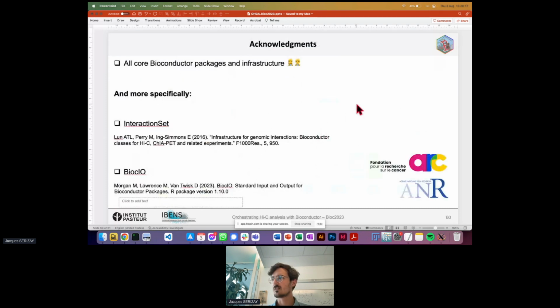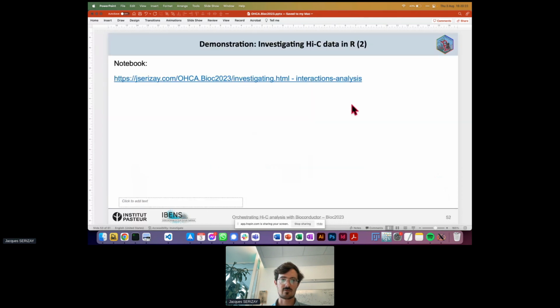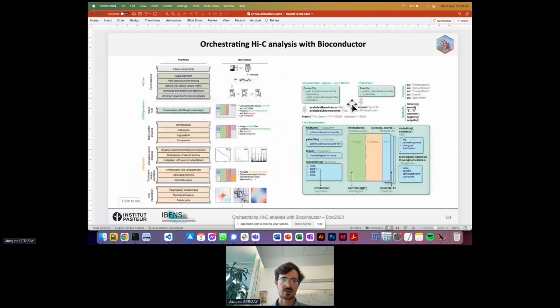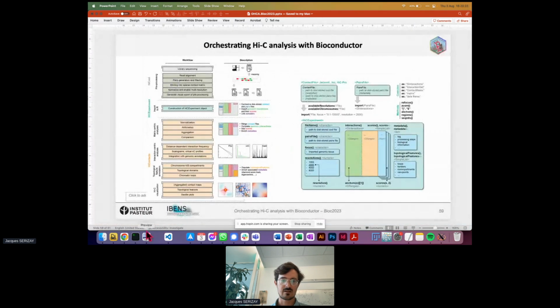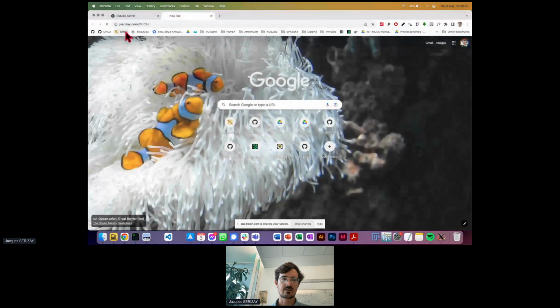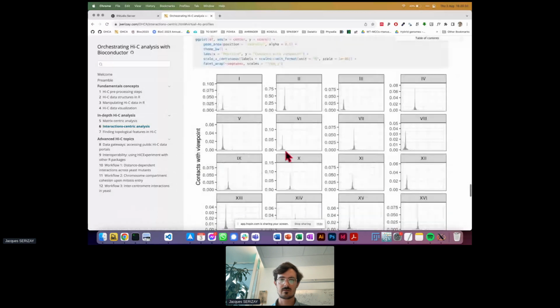Could you show a screenshot of what the virtual 4C plots look like essentially? Well, it would be this. I think I should have it somewhere real quick. In here, yeah.